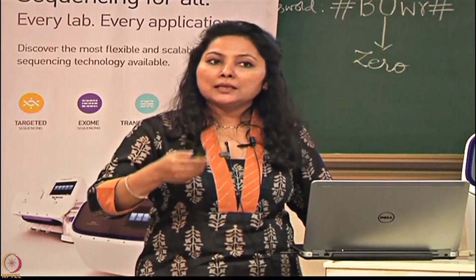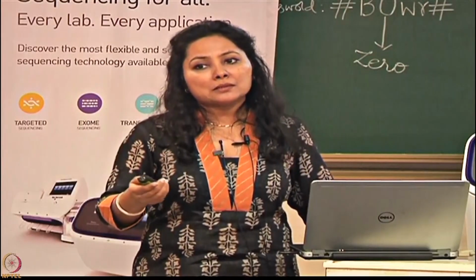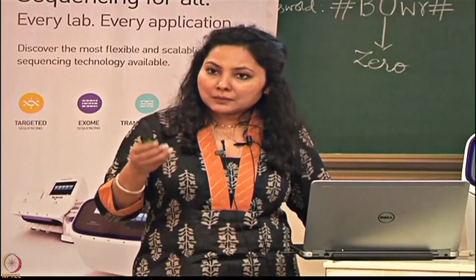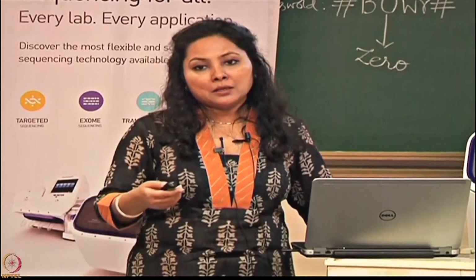Now with massively parallel sequencing, you can imagine that you have millions of wells, and the sequencing is happening in all those millions of wells, and that is how you are generating a lot of data per run. So that is massively parallel sequencing.